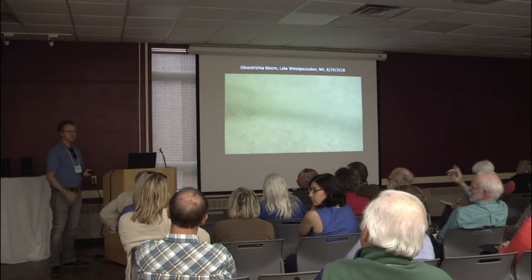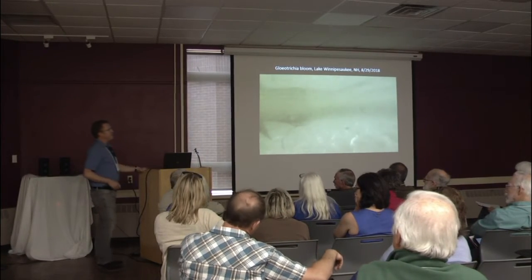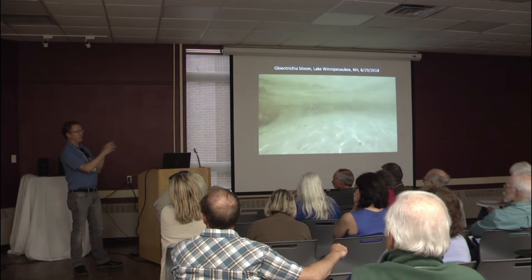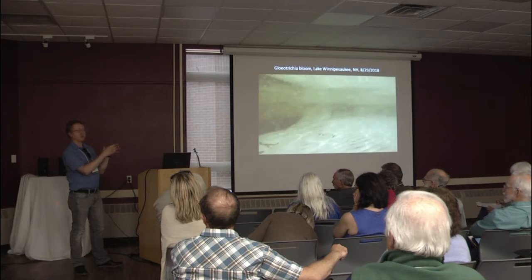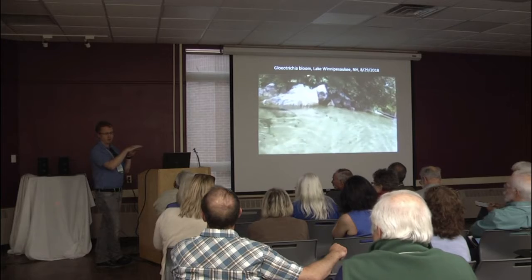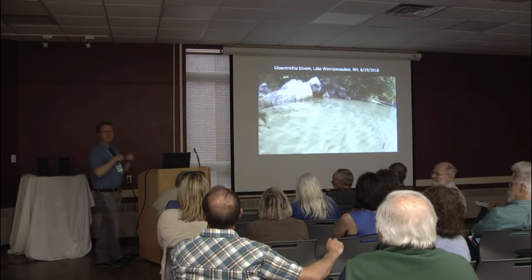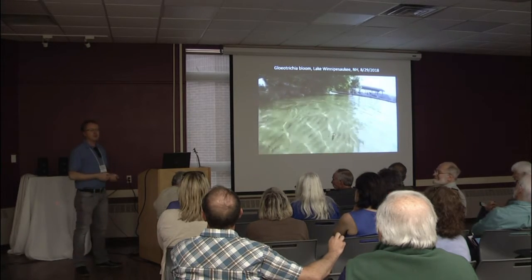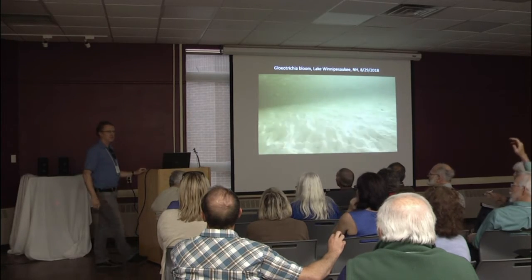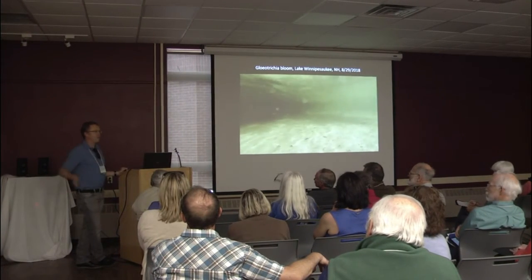How affordable is the little portable device? The new version of it, which runs 9 samples, I believe they're selling for $6,000 as the base price. Without getting too technical, it can detect up to 3 different colors simultaneously, and each level of detection is another $1,000. But for under $8,000, you can do genetic testing. So it seems like it's the kind of technology that could be affordable to a lake association.